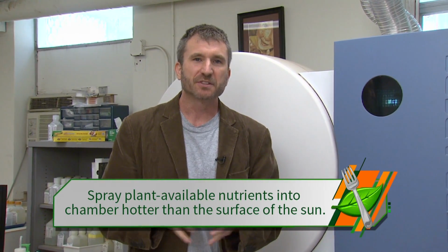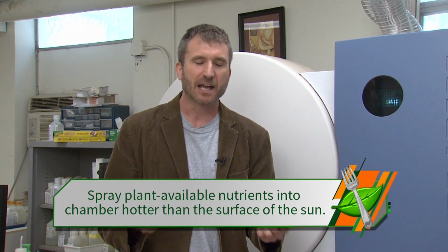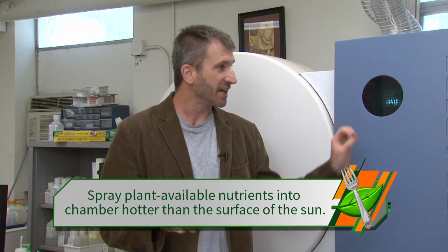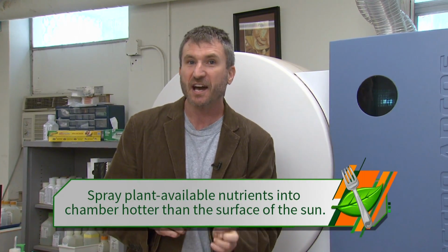And in this chamber, it is intensely hot. And I'm not exaggerating when I say there's a part in this machine that is literally hotter than the surface of the sun. Now, if you're like me, that sounds unbelievable. I thought people were pulling my leg when they first told me this, because you think, if something in there is hotter than the surface of the sun, why isn't it melting the machine? Why isn't it melting all of us?